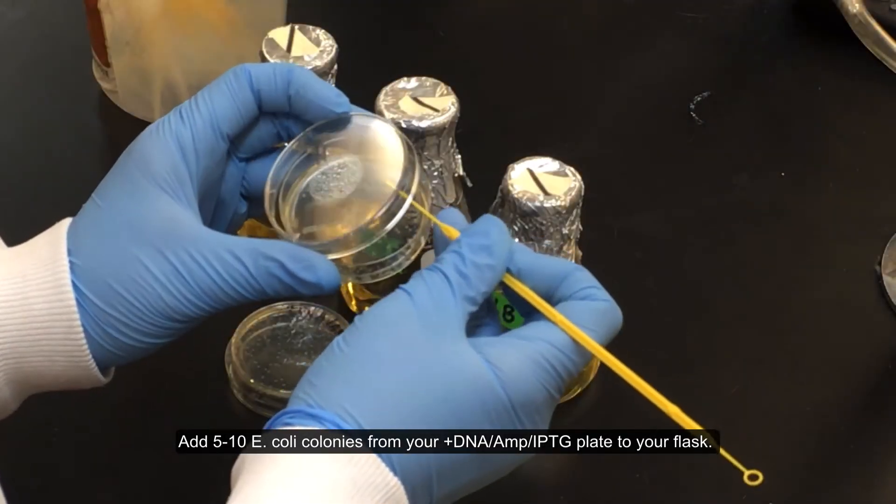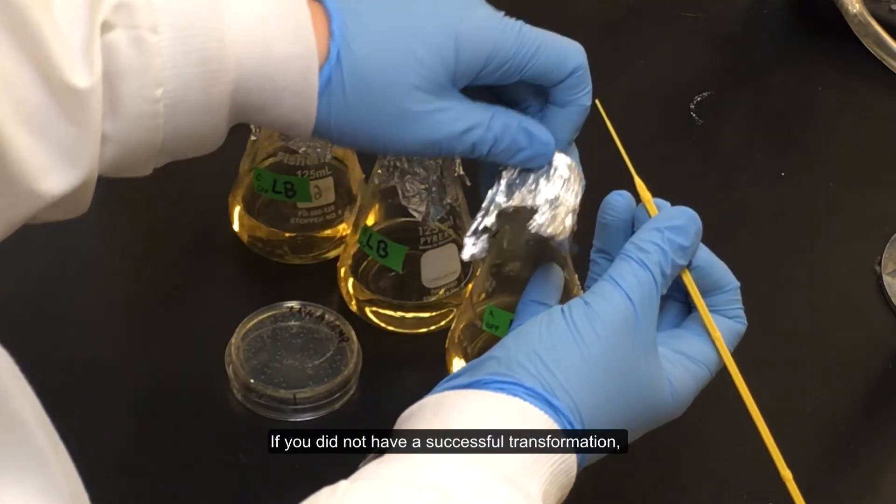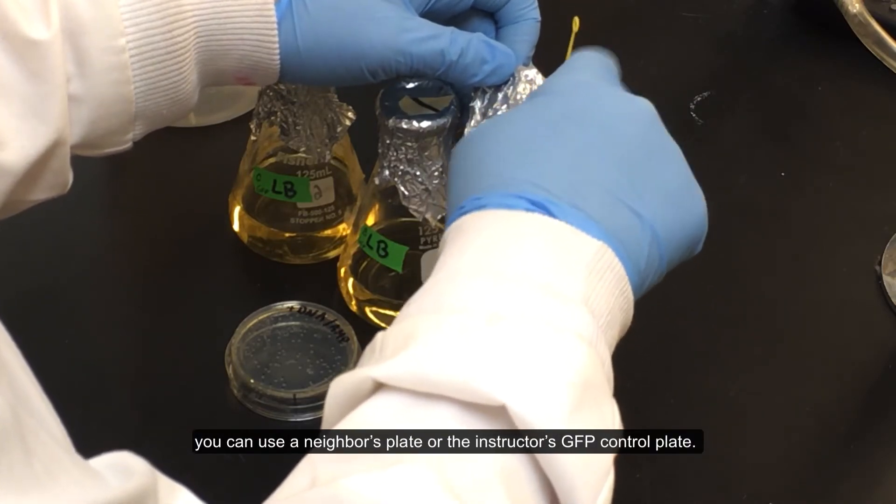Add 5 to 10 E. coli colonies from your PlusDNA, AMP, IPTG plate to your flask. If you did not have a successful transformation, you can use a neighbor's plate or the instructor's GFP control plate.